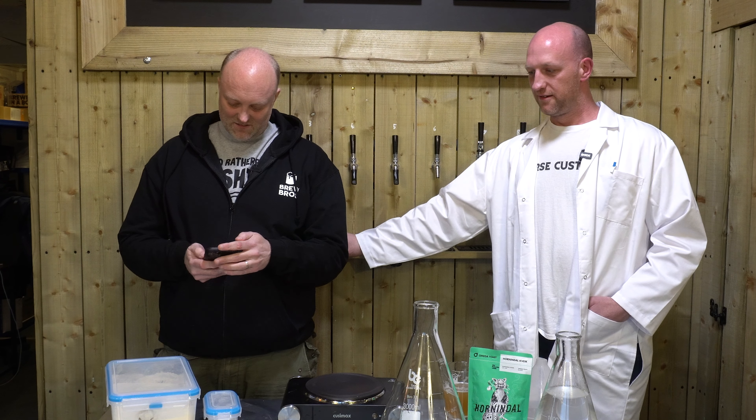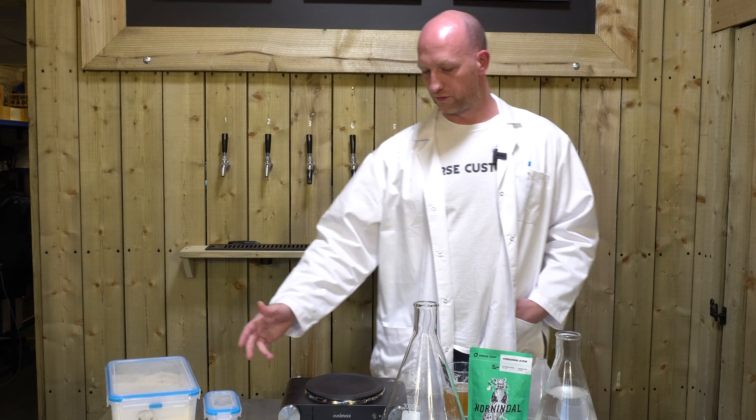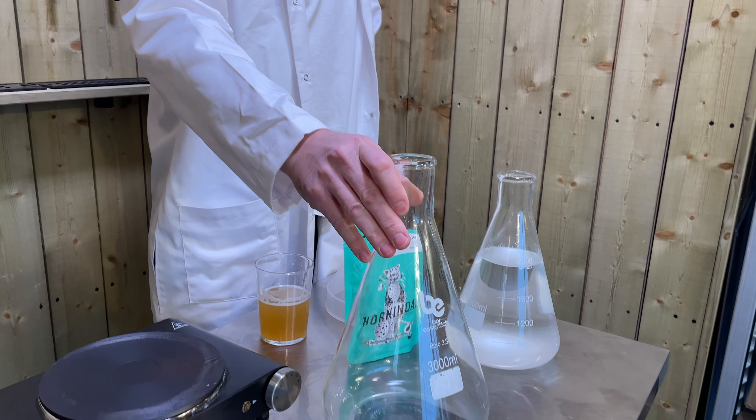Dr. John, take us through the equipment we've got on display. It's quite a simple process. We'll start off with the flask — this is called an Erlenmeyer, or a conical flask.